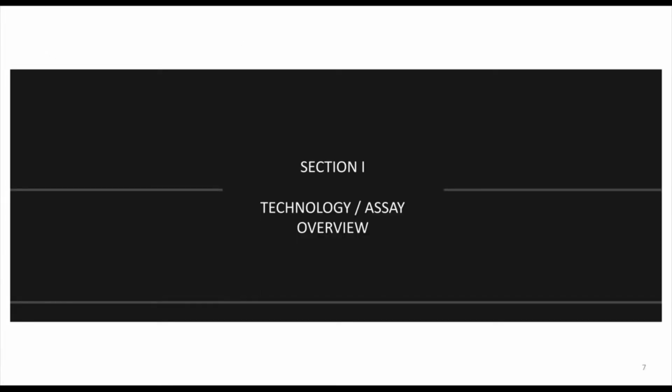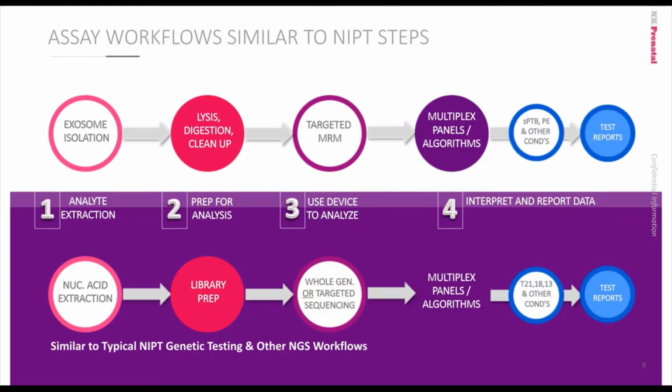I'll now discuss the basic technology and give an assay overview of how we collect the data and do the analysis that I'll be showing you later in the talk. The platform we are using for particle analysis is based on two steps. For one of them, I am lumping together several substeps, as you'll see. Initially, there's the exosome microparticle isolation step, and then there's a mass spec proteomics analysis step.